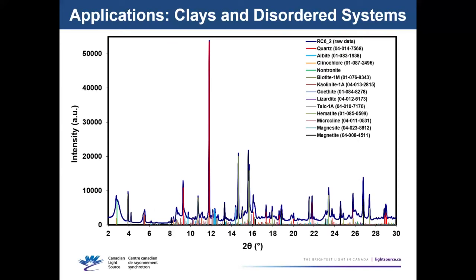And if you want to use a full Rietveld approach for clay quantification, you really need realistic physical models and advanced tools for clays like smectites before you can try tackling a sample like this. This is a nickel laterite sample with plenty of different phases, including at least 4 different clay minerals in there. And these types of samples are very challenging, and their analysis is very much a work in progress for me.